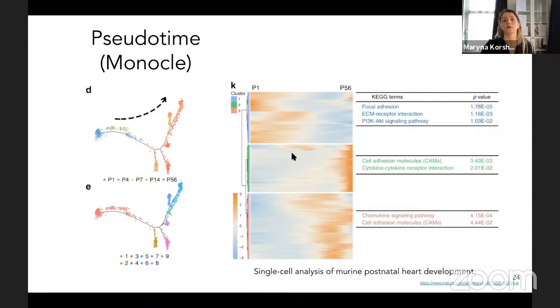And how do you visualize this? This information on gene-based level. Here you can group them by KEGG enrichment, assigning particular gene sets to the processes and seeing the gradient of their changes. That is the approach to visualize pseudotime, and it's mostly relevant to understand the disease or developmental process, the developmental process in a biological system.